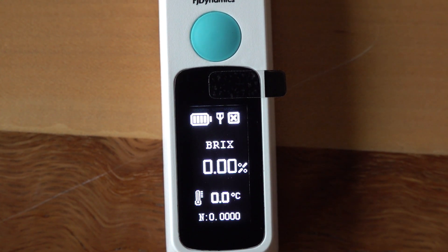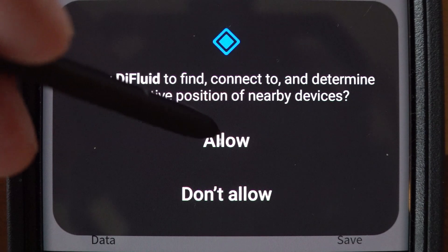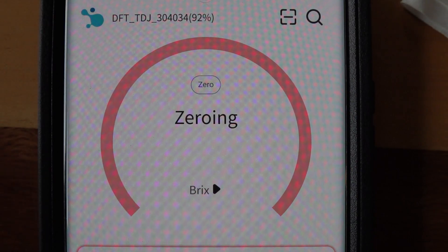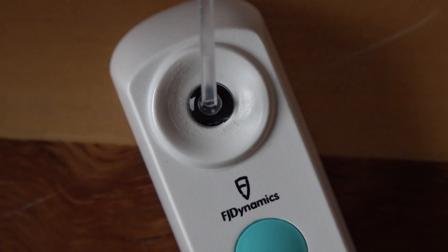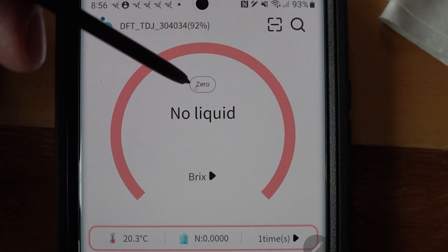I'm going to show you how well it works and make comparisons to two other refractometers, including those used by professionals. I allowed the app to find nearby devices while using it. The app already shows 92% battery. Now we're going to zero it out — it says 'no liquid,' so we need to add distilled water. I'm using one of the pipettes that came with it. The water is at the same temperature as the device, and the other devices we'll evaluate are also at the same temperature.